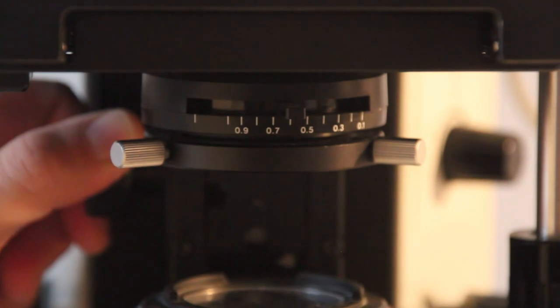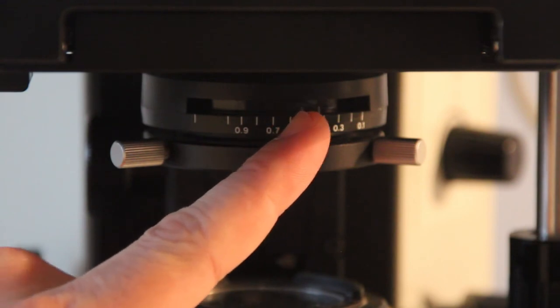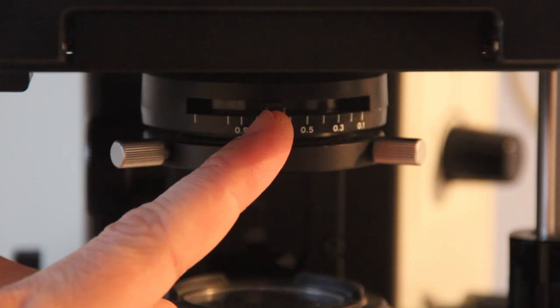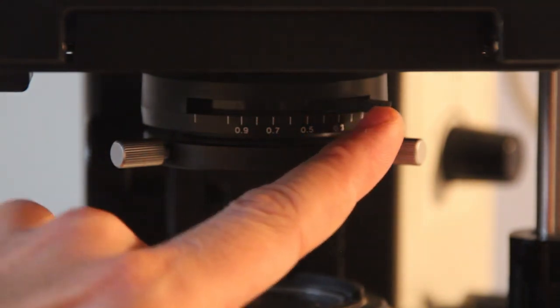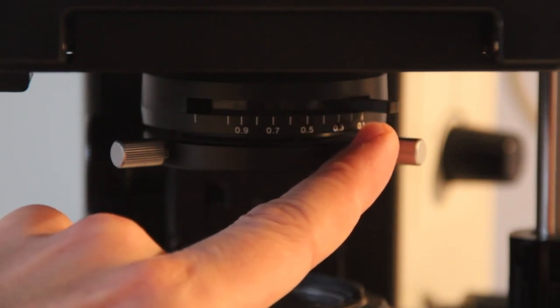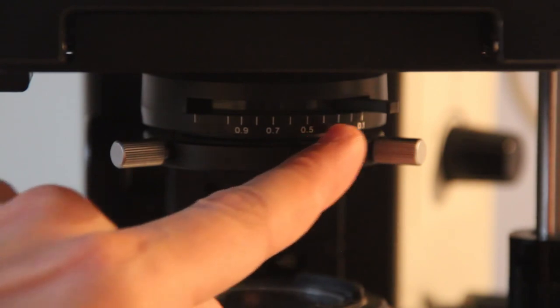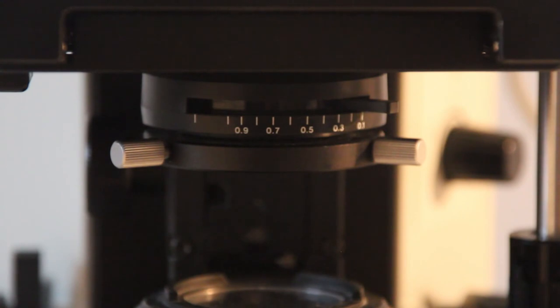Now it's time to adjust the condenser aperture diaphragm. There is a horizontal lever in front that can be moved towards the left and towards the right. For focusing, it's best to move the lever all the way to the right towards the position labeled 0.1. By moving it all the way to this position we both increase the depth of field and we also increase the contrast, which makes focusing much easier.